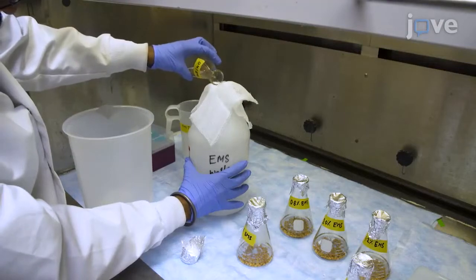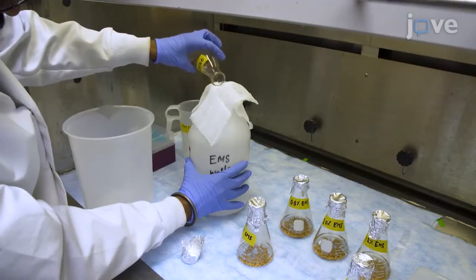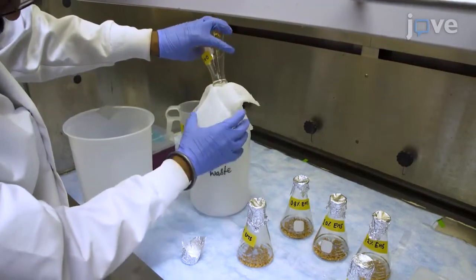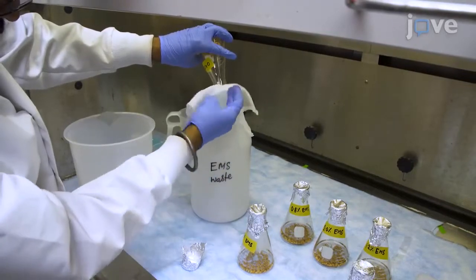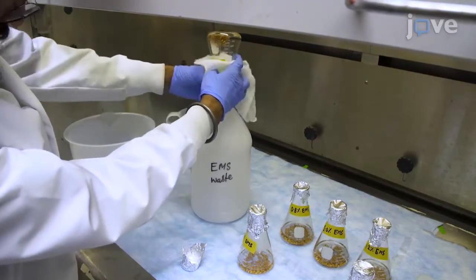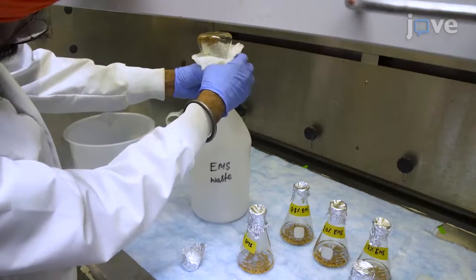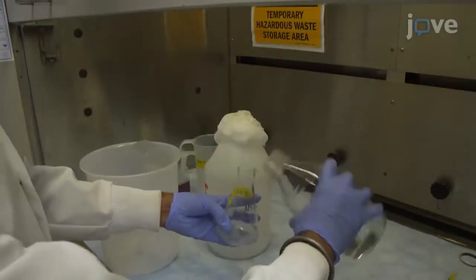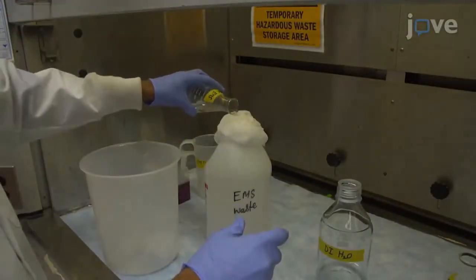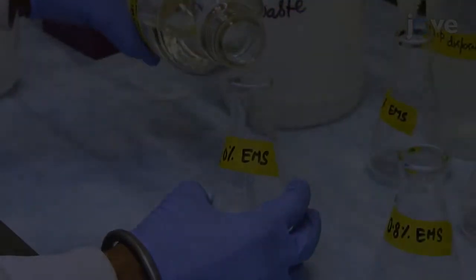Now, decant the EMS solution into an empty waste bottle and pour the treated seeds onto cheesecloth placed on an empty waste bottle to collect separately for each treatment. Use extra water to help pouring of the seeds.